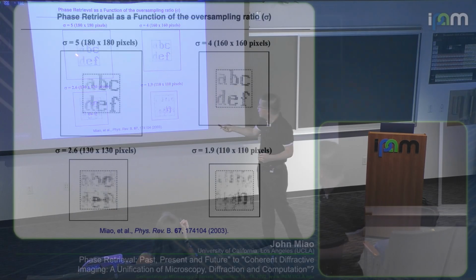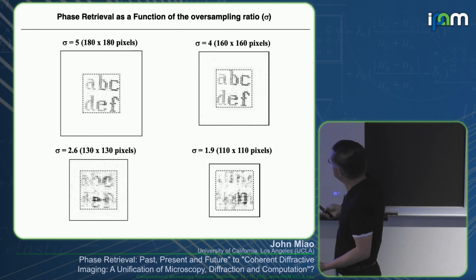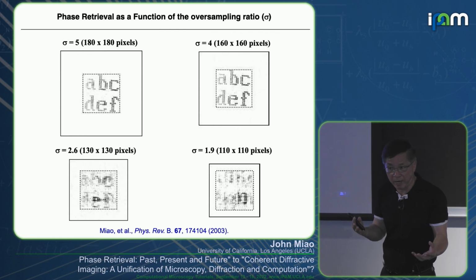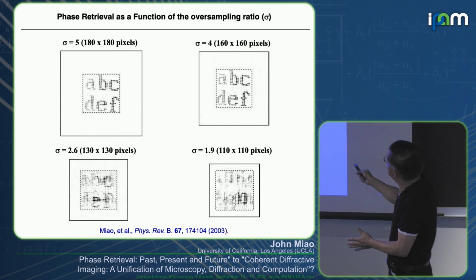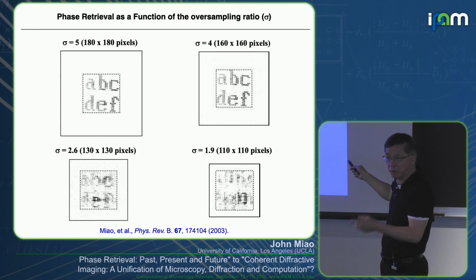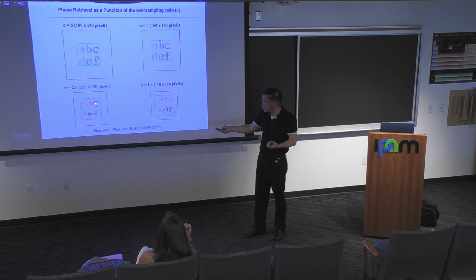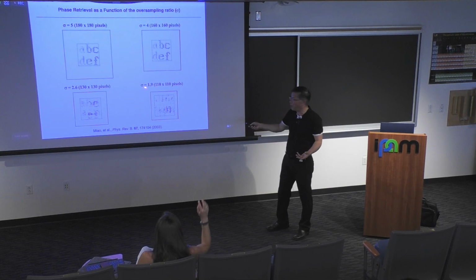Okay, and is the reconstruction good? When I downsampled this, you can see the resolution is the same because I maintain the same spatial resolution. The resolution is determined by angle, and the diffraction angle is still the same. But you see this square getting smaller. This is the same, it does not change because of the same spatial resolution. So this 0 is getting smaller as I downsample. This is still good, you can still see it. And this one is completely not right.